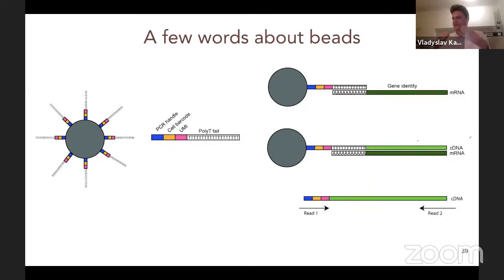And that's why all of this processing bias can be summarized together as batch effect in that case. On the other hand, even the number of cycles that they are using for the amplification in the next steps, when you are working with the cDNA, can also cause some batches. When you amplify a little bit more in one sample and in the other sample you're amplifying a little bit less.